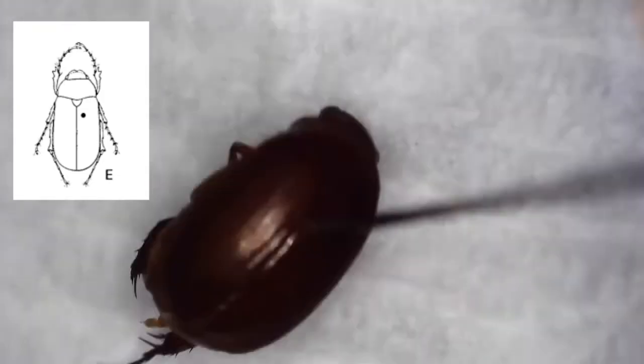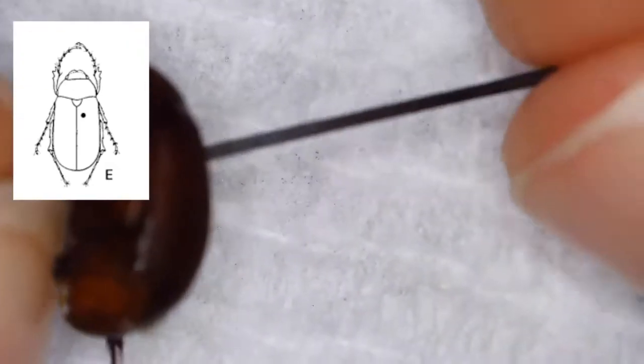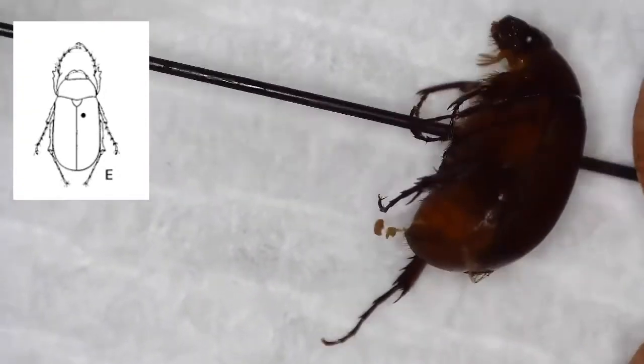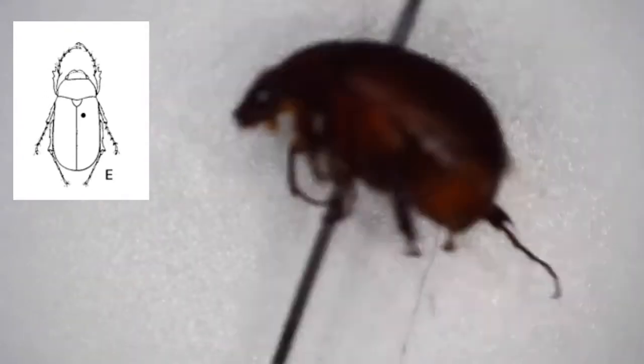So once I do that, you push the insect up. This is easy enough to do with the three-step block that came with your kits, but I don't have one of those. So I just push it up to about two-thirds of the way up the pin with the remaining third above it.